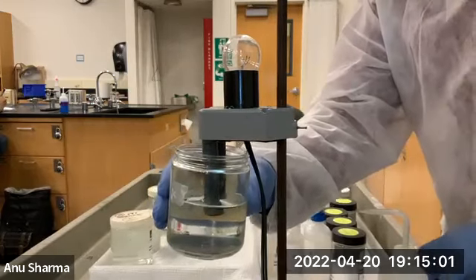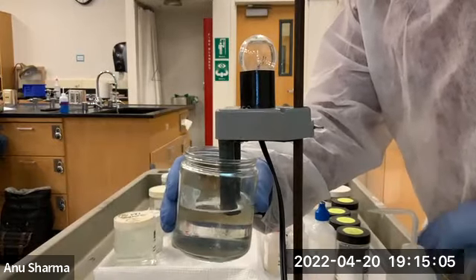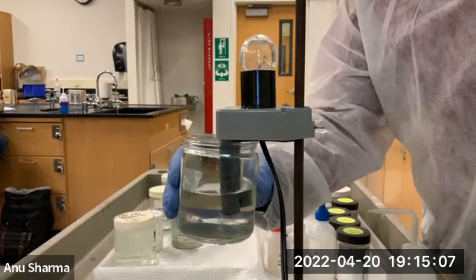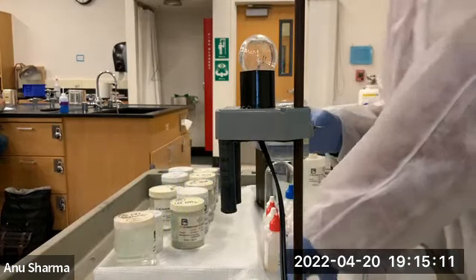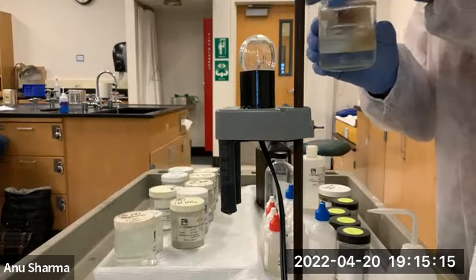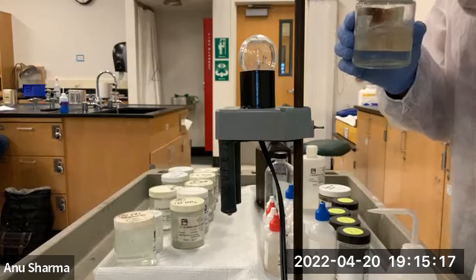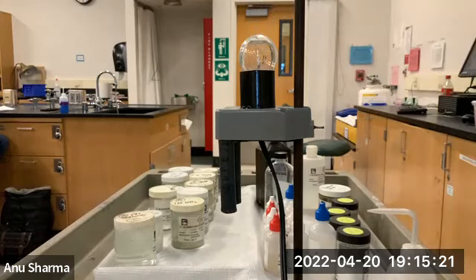The bulb did not light up because the OH ions did not get released. Do you see that? There is covalent bonding in this molecule, C2H5OH. That is the ethanol, also called ethyl alcohol.